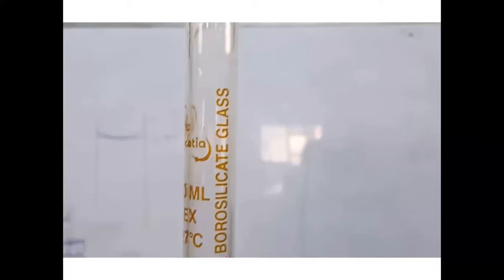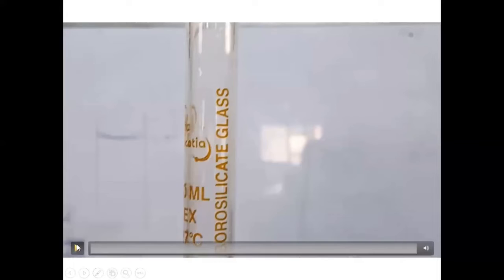See, this is a short video for demonstrating how burettes look. See, this is very important that when you start your titration, although it is not necessary, in our intermediate system we always start with 0.